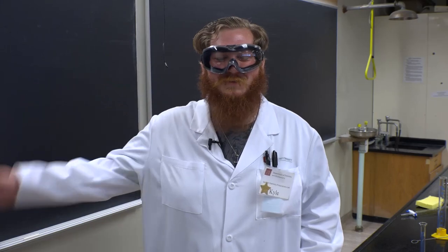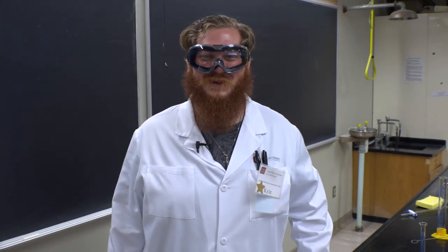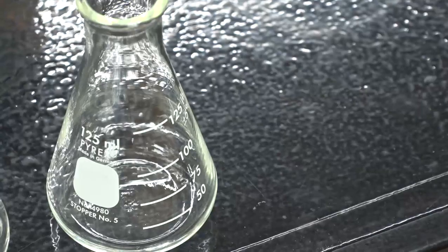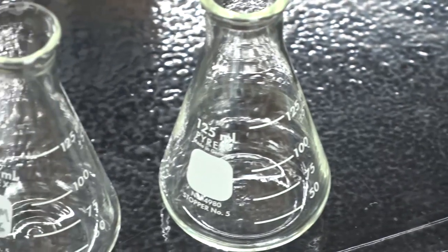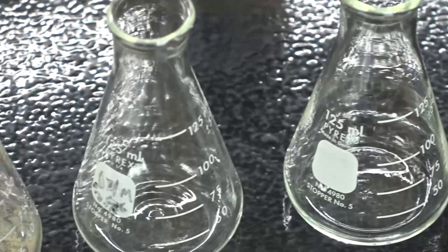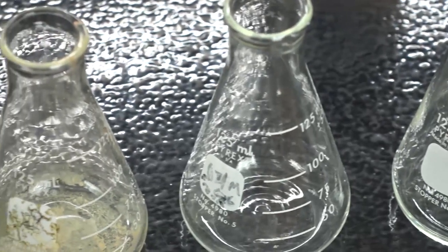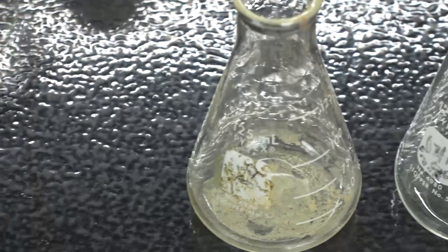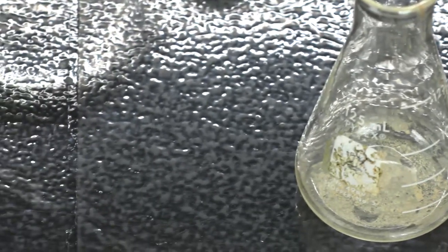Hello everyone, I'm Kyle, and today I'm going to demonstrate how you should clean your glassware in your common lockers. At first thought, you might wonder why cleaning your glassware is so important in the lab, but when you are working with your glassware, it may quickly become clear how your results in lab can quickly turn south if your glassware is not cleaned properly.